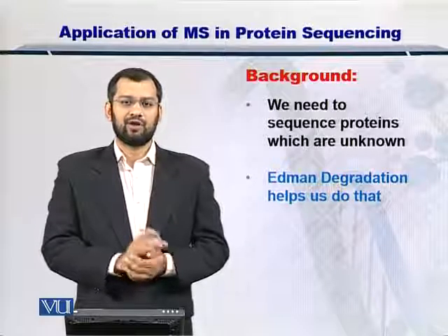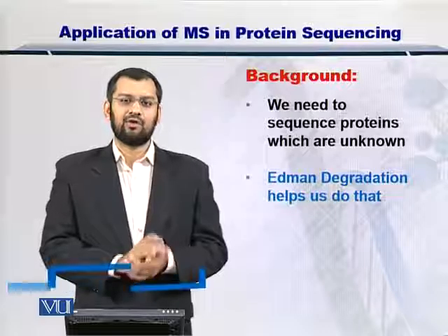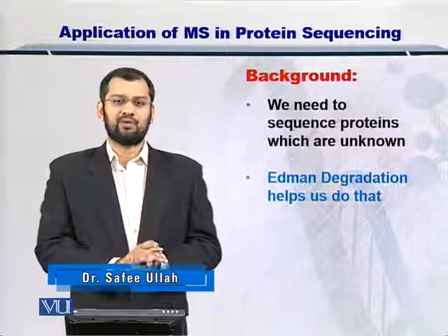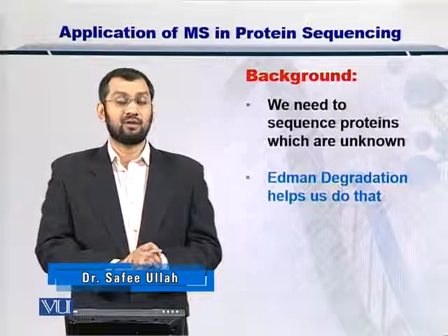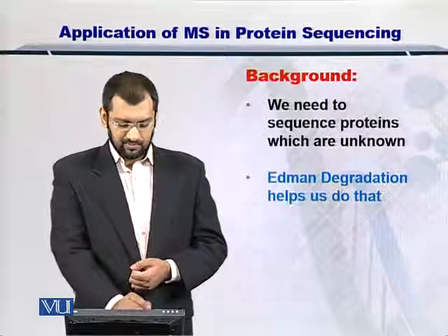So to your rescue and to my rescue is the mass spectrometry based proteomics. So it can help you to sequence very big proteins as well as look at their post-translational modifications and to quantify them. So it's an extremely powerful technique that is available to us now.